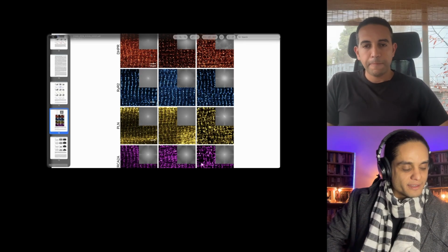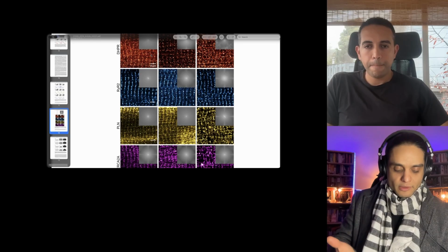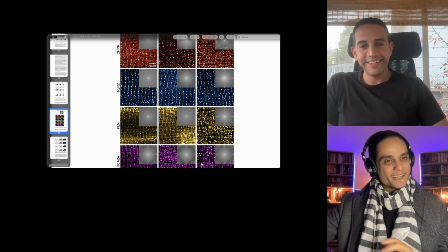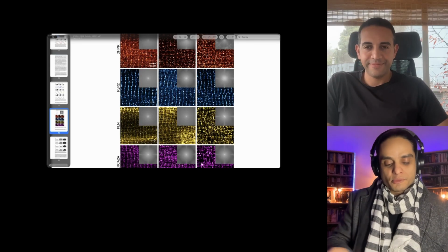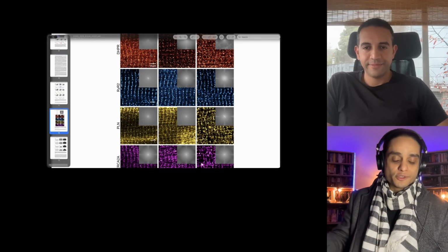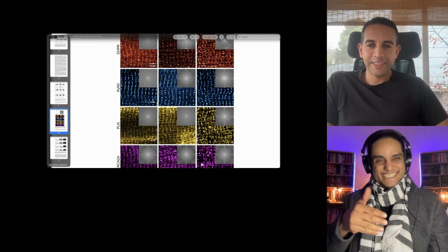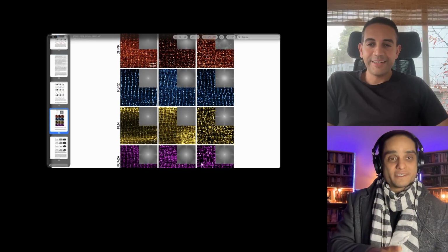Another thing, just to give people an idea, is that the season can play a role, because the sun is not at the same place all the time. If you do the experiment, for example, in January, and you try to redo it 2 months later because you want to reproduce it, maybe at that exact specific time the sun will be hitting your cells on the bench in a specific way, and that will definitely have an effect on your results. So you have to be careful of these types of things.